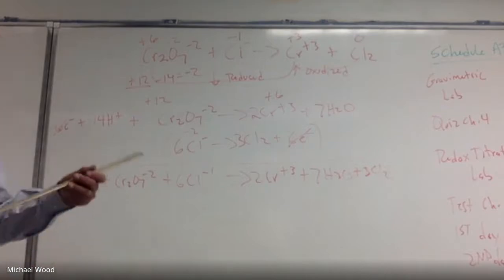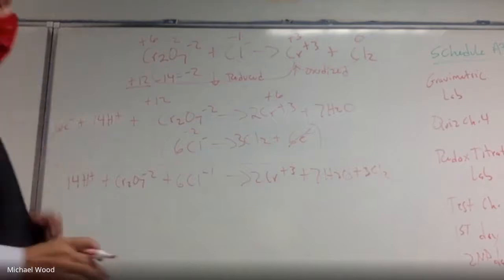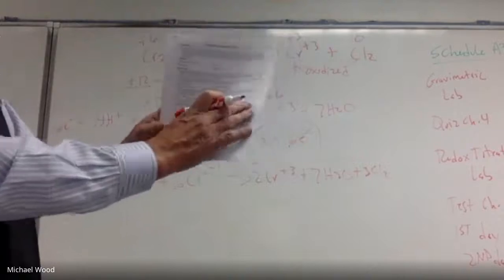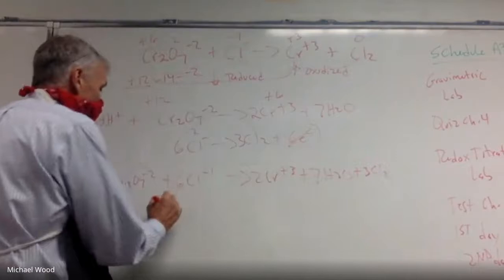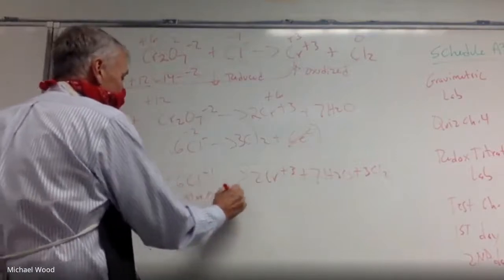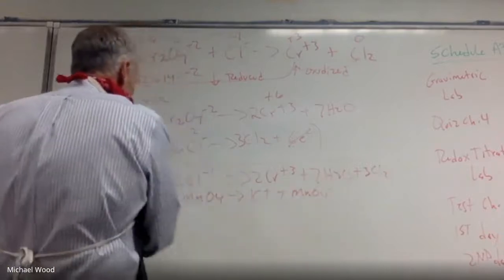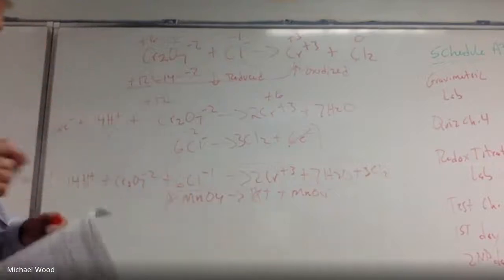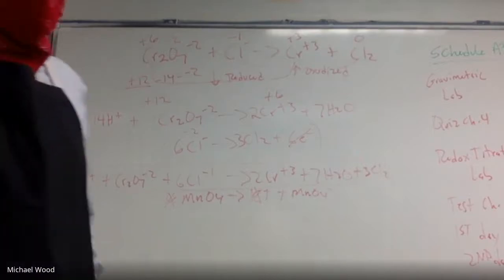Okay, now on the lab. If you look on this pre-lab, it's the first reaction, like you could ask a great question. You go, wait, we got potassium permanganate. Well, because of the potassium, it breaks down. And potassium is always going to be a spectator ion. So potassium, sodium, whenever you see those, they're a spectator ion. So you're going to get rid of those.